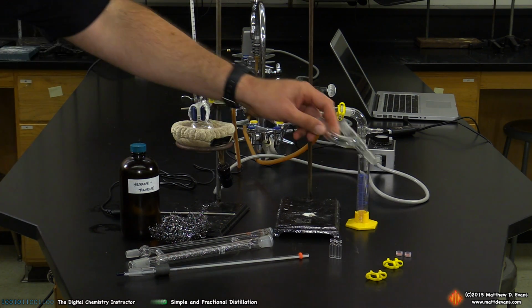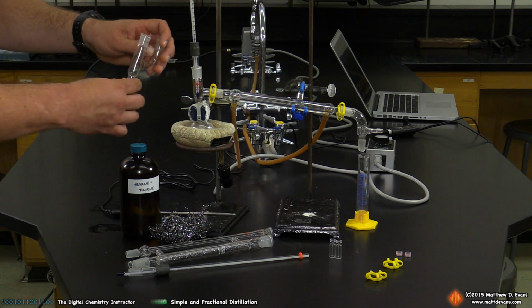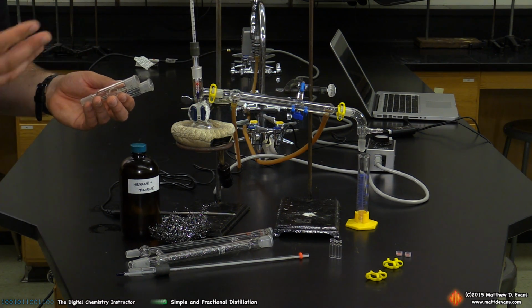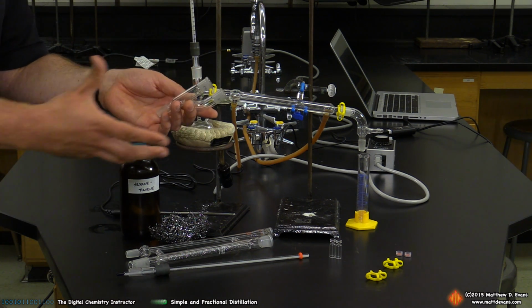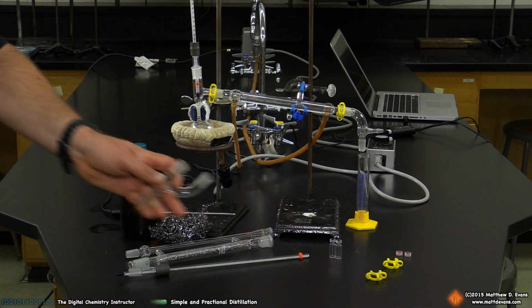I'm also going to mention one last thing. This is called a Claisen adapter, however you want to pronounce that. Sometimes you'll see people position this before the three-way adapter, especially when they're doing steam distillations of natural products. Sometimes they get really foamy, and so this acts as an extra trap so you don't get the foaminess coming over in the condenser. But we're going to skip that because this is not a natural product steam distillation.